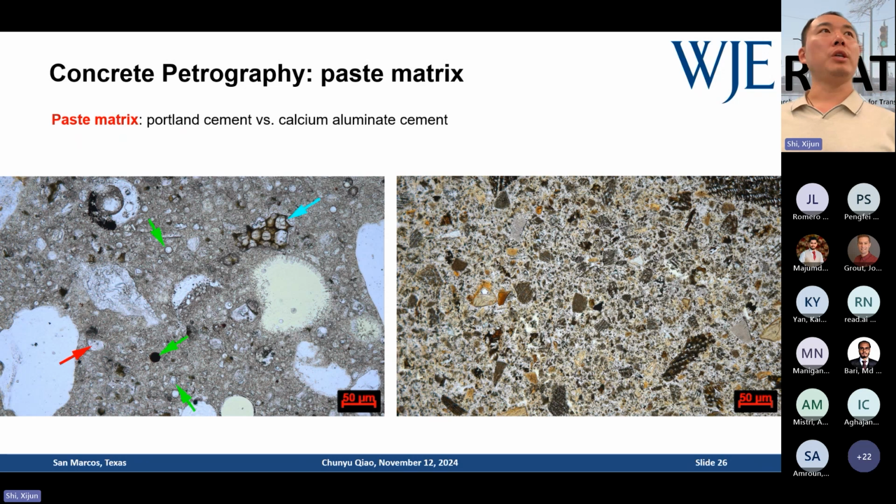I think when you learn cement chemistry or hydration, alite is very active, right? So it produces most CSH and calcium hydroxide. So it reacts very fast. You normally don't see a lot of big particles of alite. So you only see very, very rare remnants of it with a well-defined hydration ring, which is indicated by the red arrow.